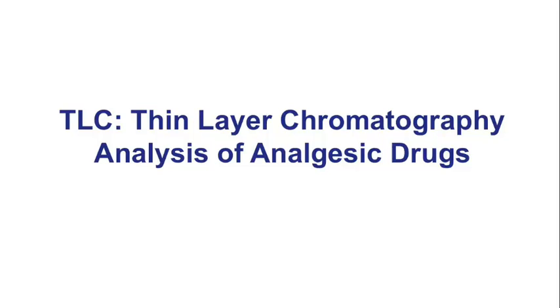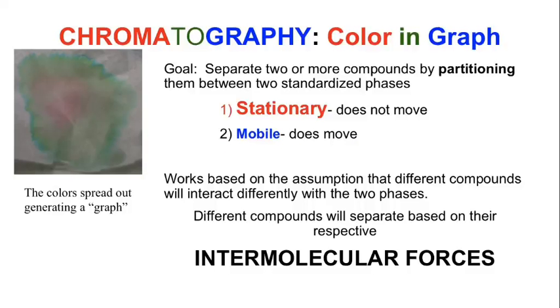So the lab to be performed this week is going to be thin layer chromatography, also known as TLC. And in this case we're going to use it to analyze some analgesic drugs. So before we get into the actual technique, let's evaluate what chromatography is.